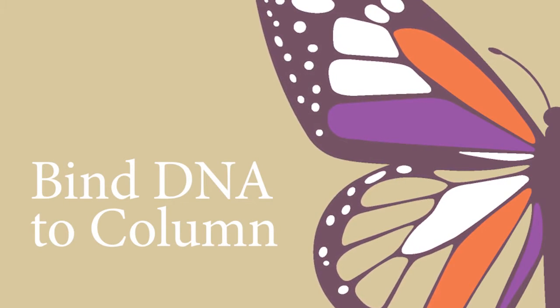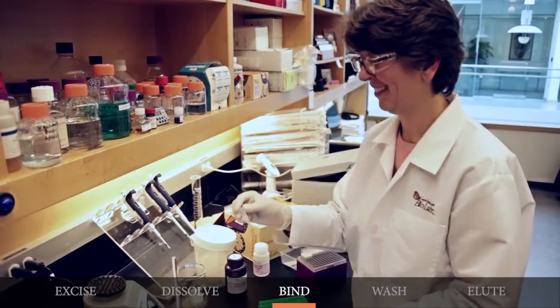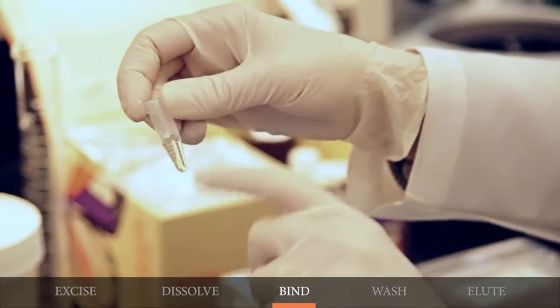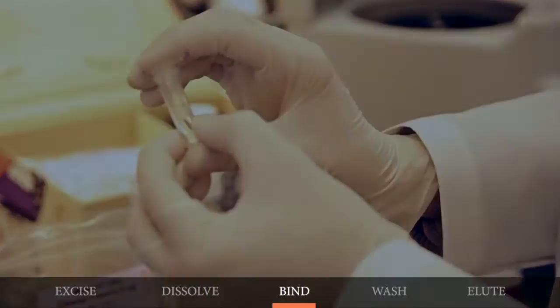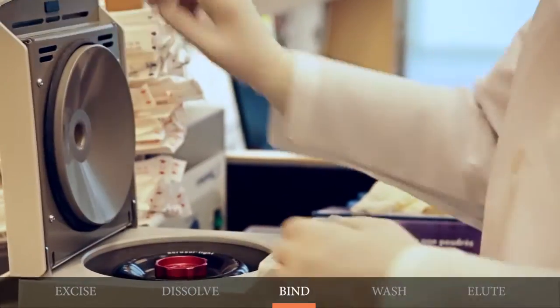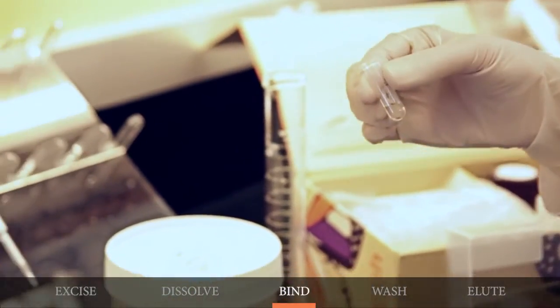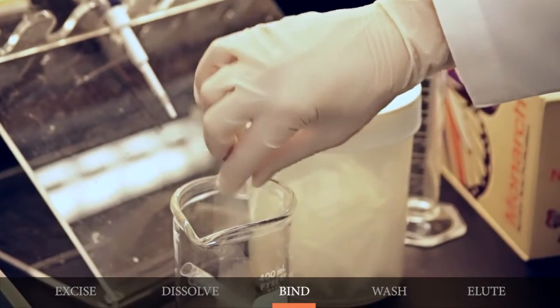Next, bind the DNA. Once the gel slice has dissolved, load the sample onto the column and close the cap. Centrifuge the sample for one minute and discard the flow through. The DNA is now bound to the column's matrix.